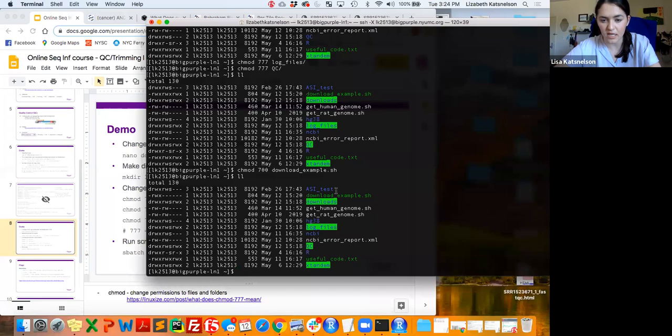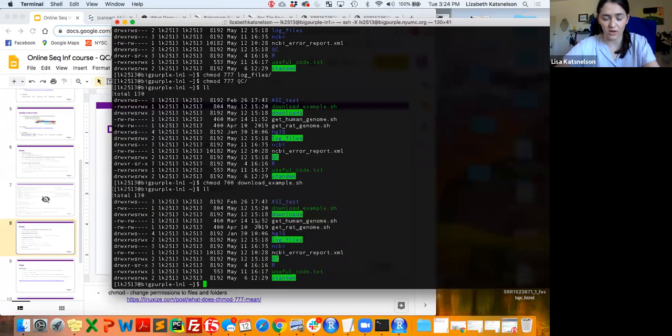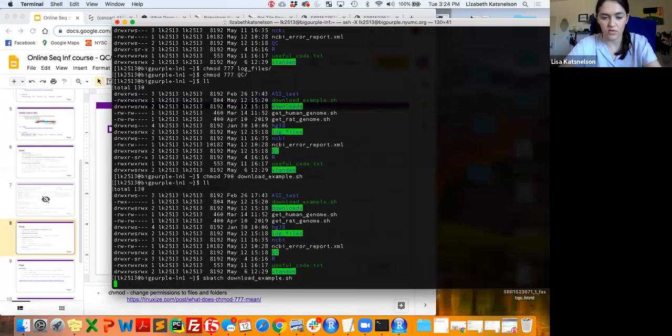Yeah, so this is essentially ready for running. I'm going to say maybe don't run this right now on your computer, because I think BigPurple might be a little backed up right now. And if we all submit these jobs, it definitely won't run for everyone. I was even having some issues getting a job to go yesterday and earlier today. So just for your own knowledge, if you were to submit this job, because this script is technically ready for you to run, you would just do sbatch and then this downloads example, and then it would run.